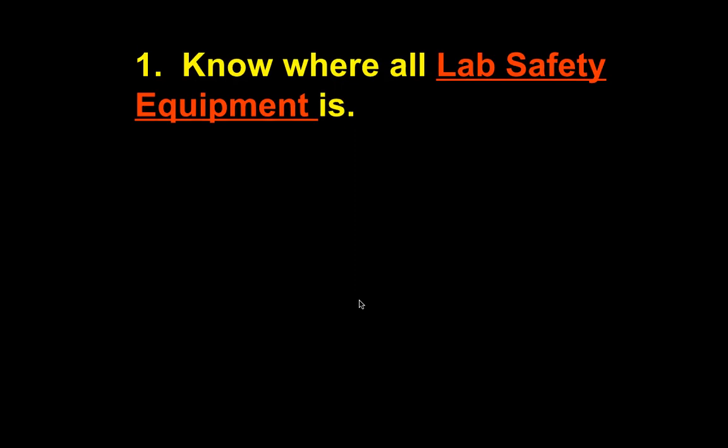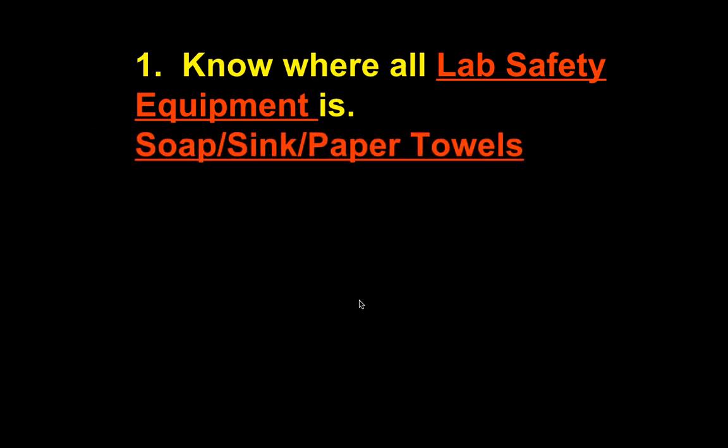Number one on your note sheet: know where all lab safety equipment is. There's a big space because I expect you to write them all down. If we have a quiz, I might ask you to point to where the fire blanket, fire extinguisher, or gas shutoff valve is. Soap, sink, and paper towels — wash your hands after every single lab. We have four sinks; three have three faucets each. Wash your hands because other people use this equipment — it could be germs, acids, things like that.